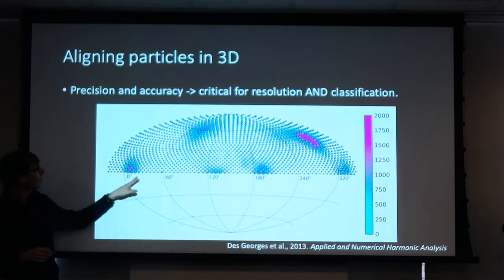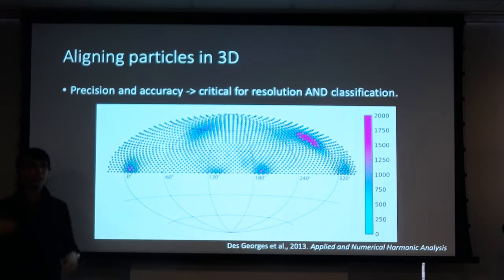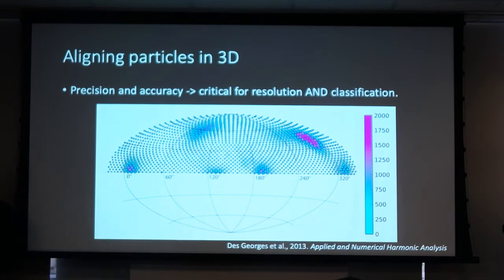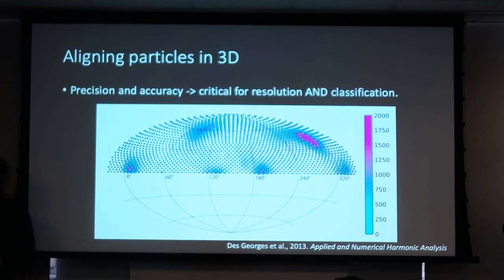That's because now they know exactly where they should be in terms of alignment, and they can really decide which class they belong to. And so if you have minute differences between your classes, that would be absolutely critical in figuring out where to go. So always be careful with that. If you use refinement, check how particles are switching class. And if they keep switching, it means you need to go to finer angular increments.